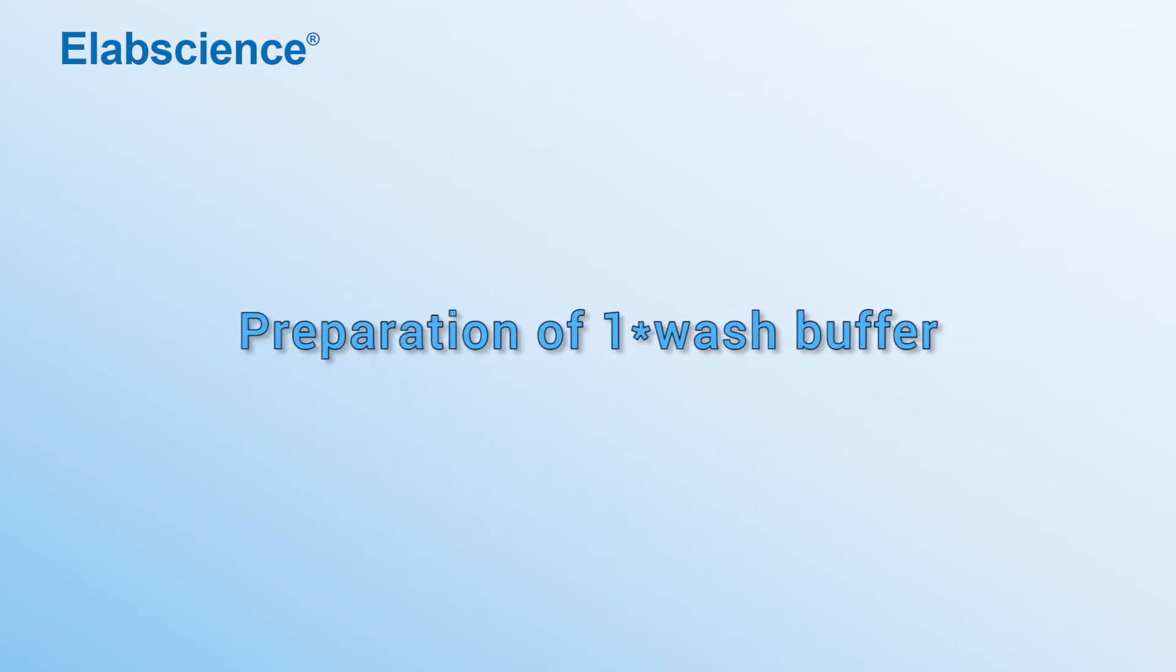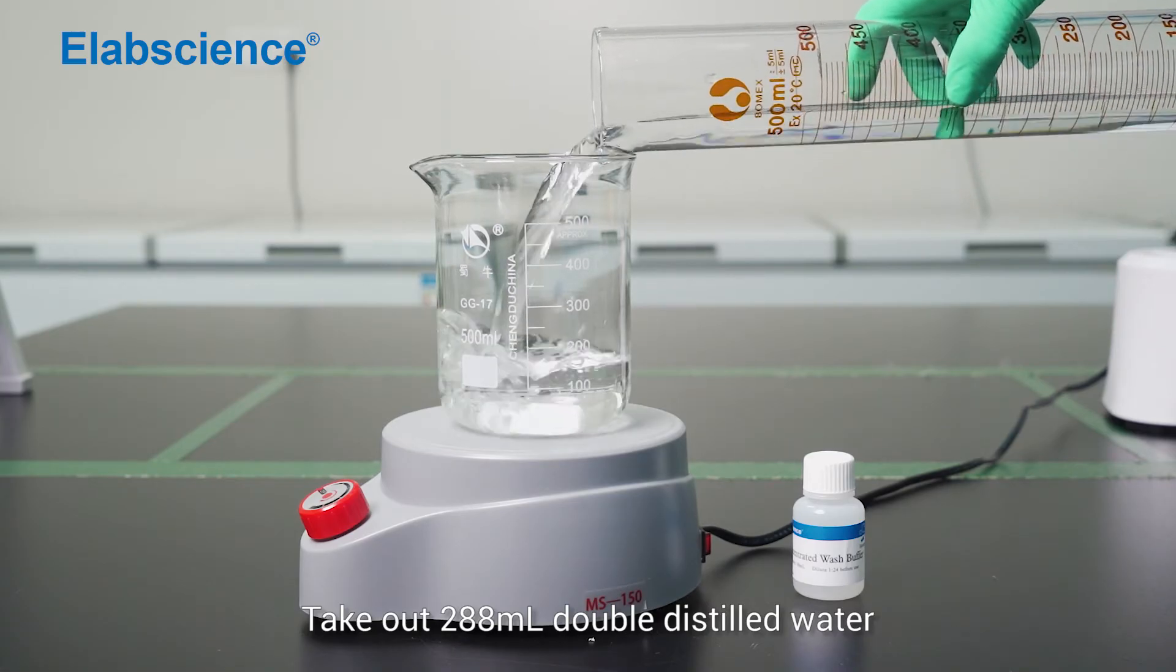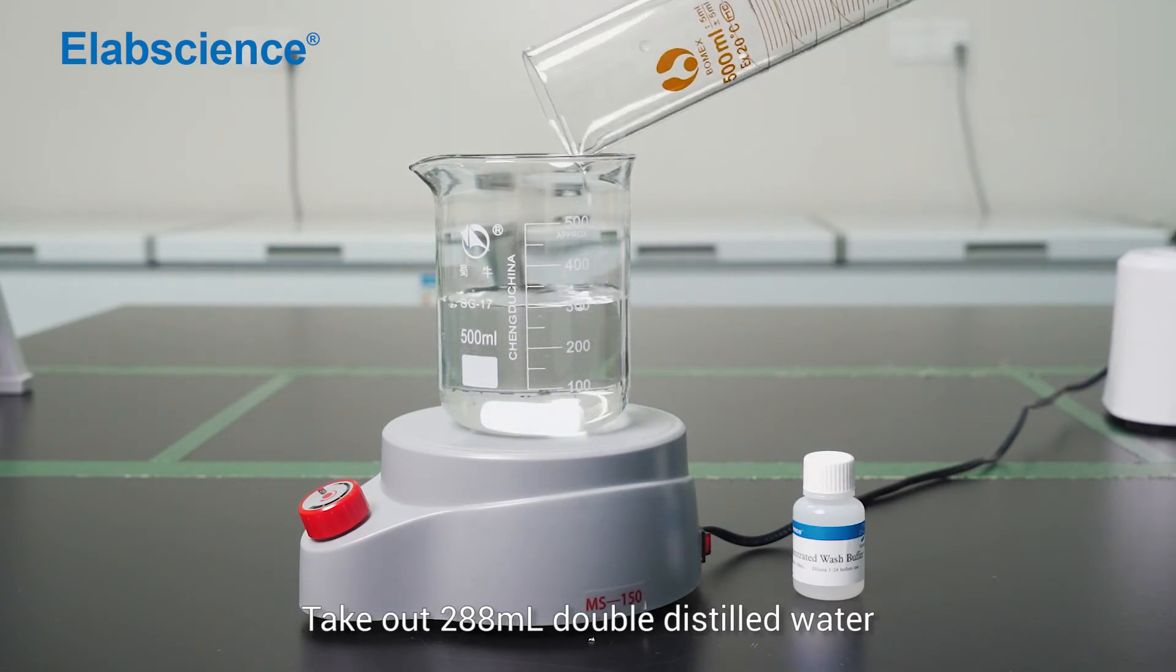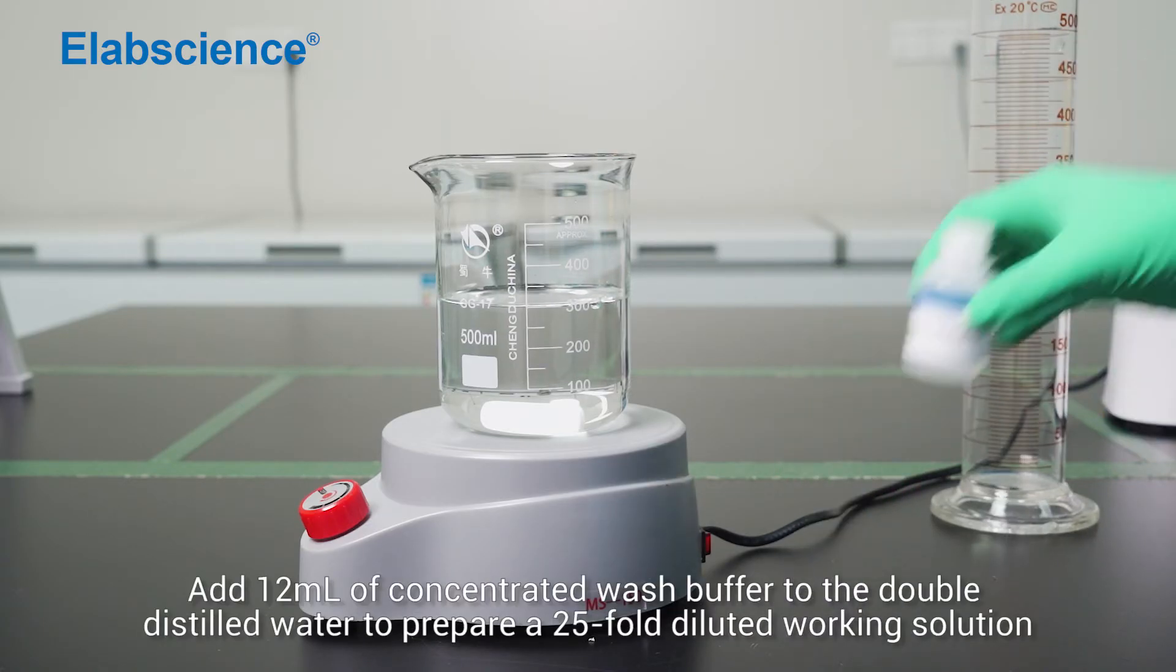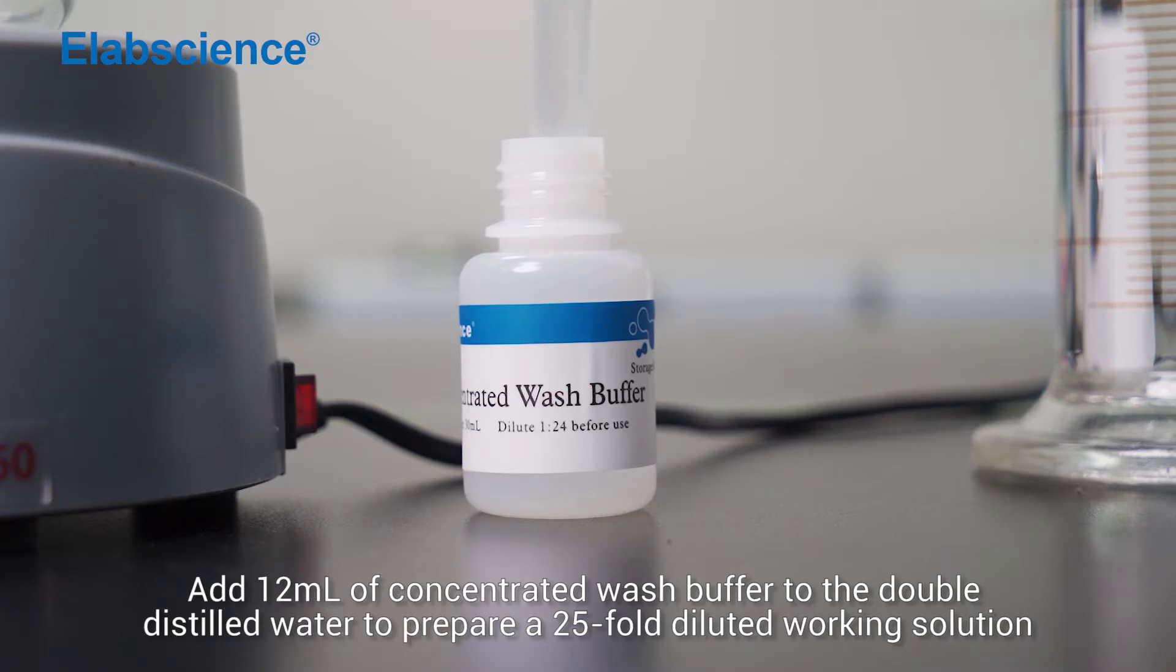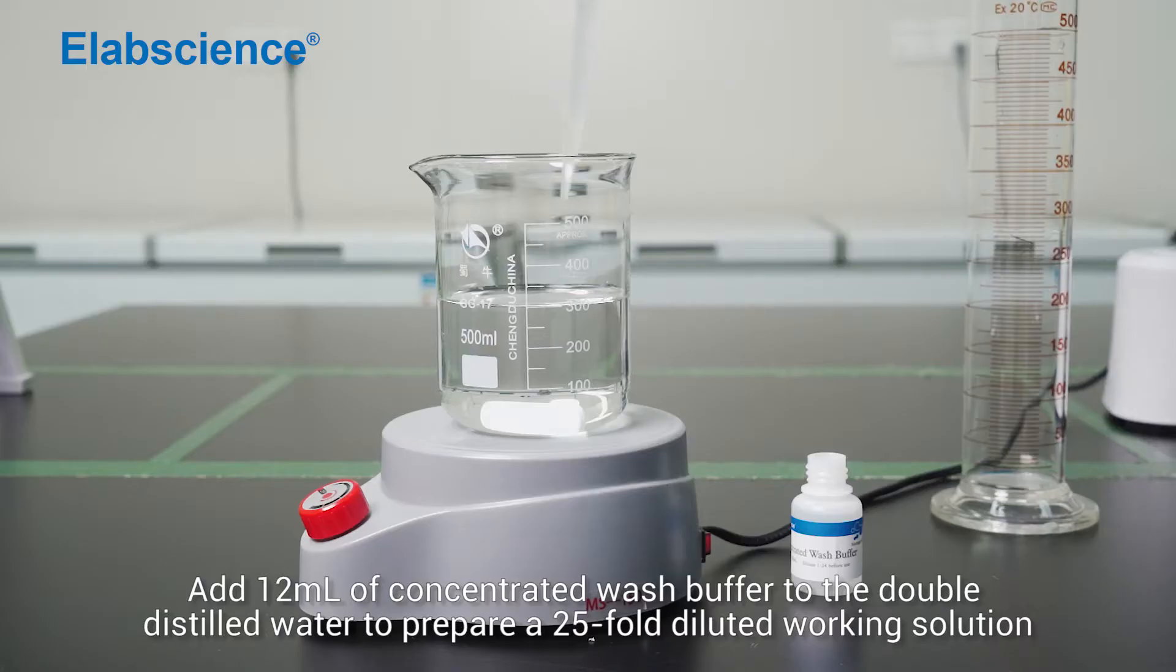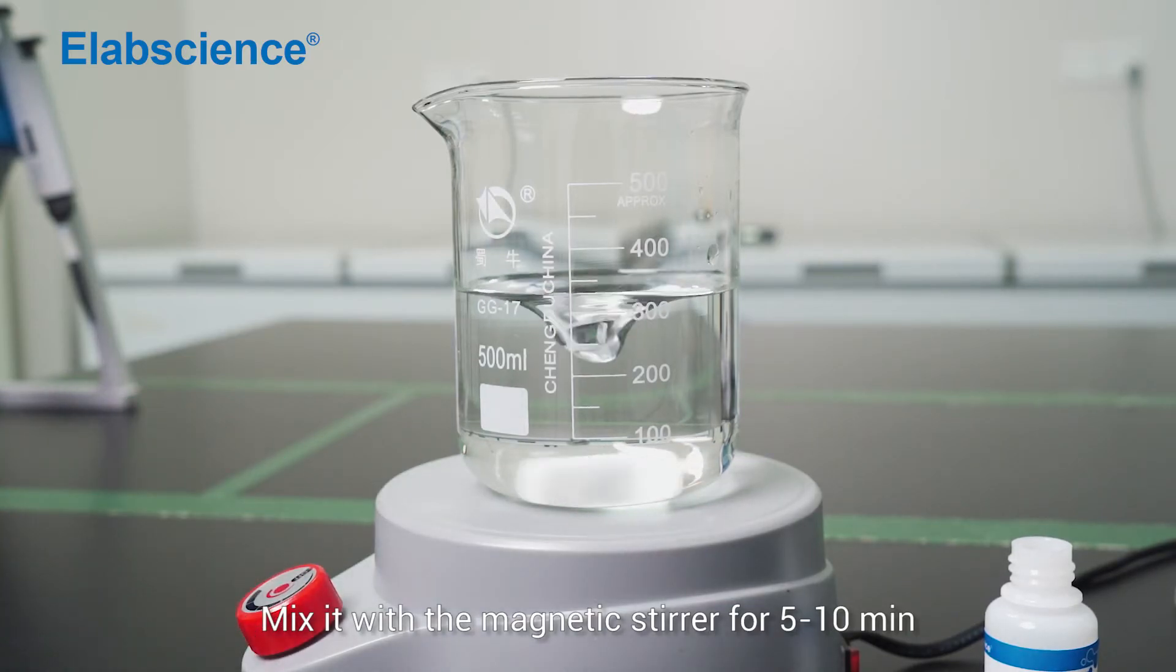Preparation of 1-time washing buffer. Take 288 ml of double-distilled water. Add 12 ml of concentrated washing buffer to the double-distilled water to prepare a 25-fold diluted working solution. Mix it with the magnetic stirrer for 5 to 10 minutes.